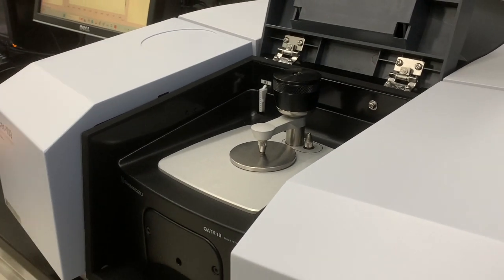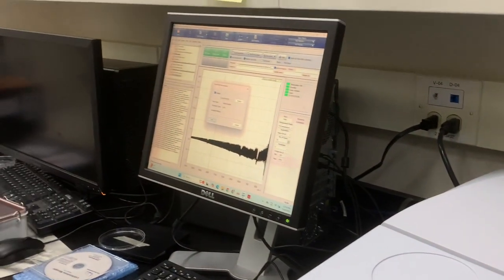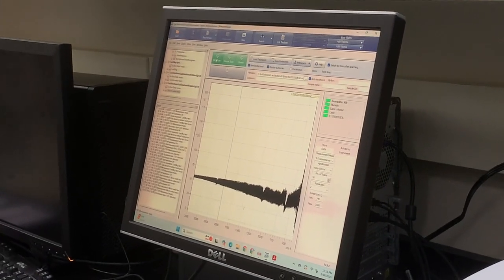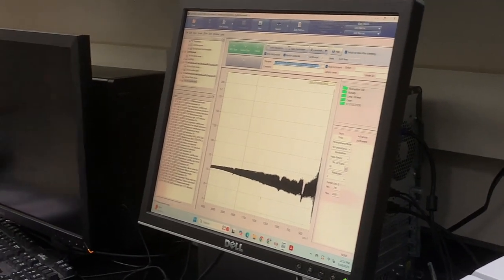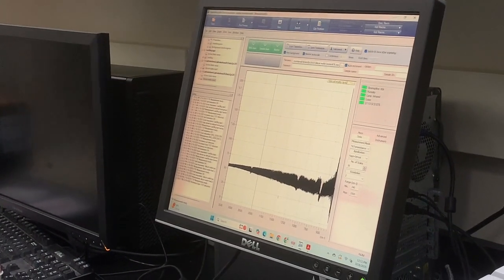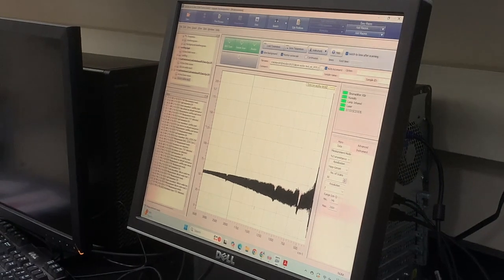I think the point is that you should keep going till you hear a sound like something ticking. It says that it's a good contact. Yeah, it could take something. Once you try to do the same thing, so I'm not sure that this is the case. And here's one for you, but you know how to get in contact with me, Mohammed.